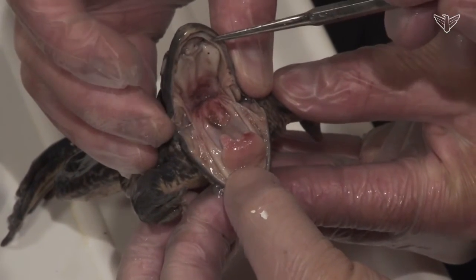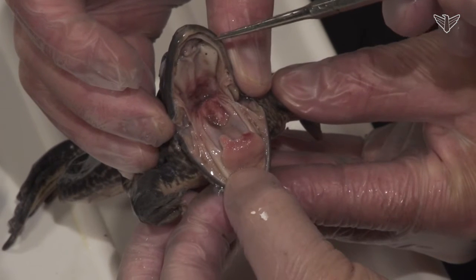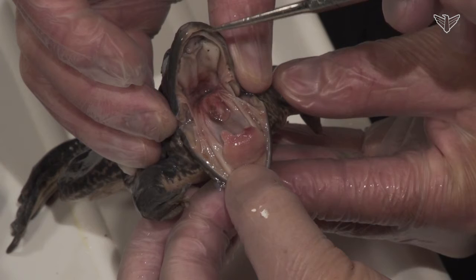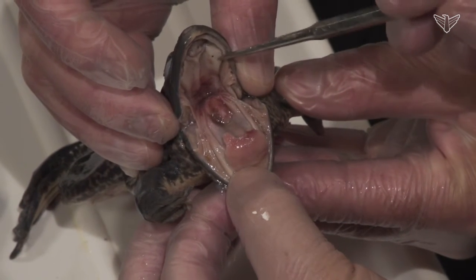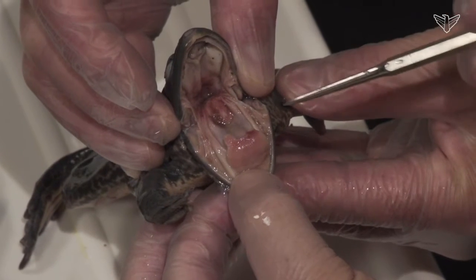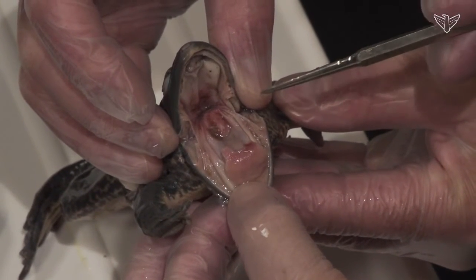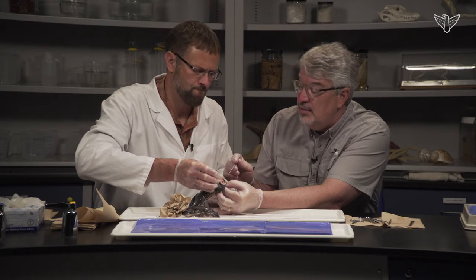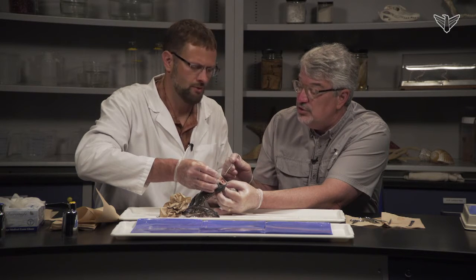There's a ridge of small teeth. You can kind of feel them. They're sharp, little serrated structures. There's an outer layer and an inner layer, the maxillary and the vomerine teeth, or palatine teeth, sorry. Those two rows kind of hold food. They're not really for tearing or chewing. Mostly carnivore? Yeah, mostly they eat insects and other small aquatic animals.